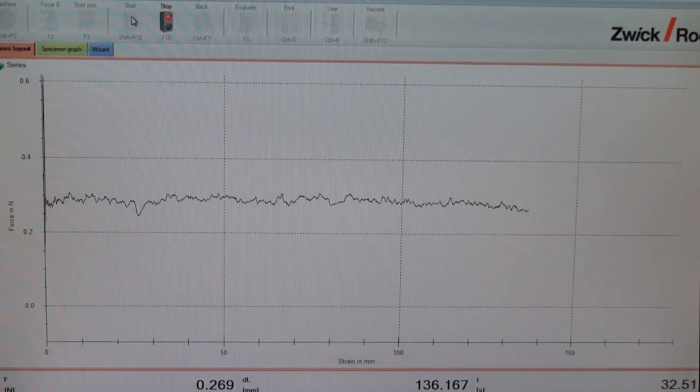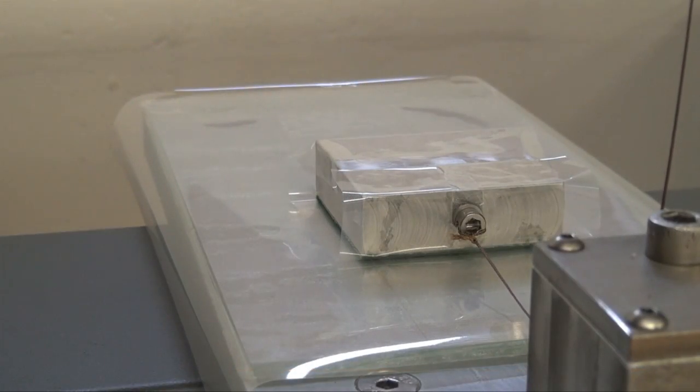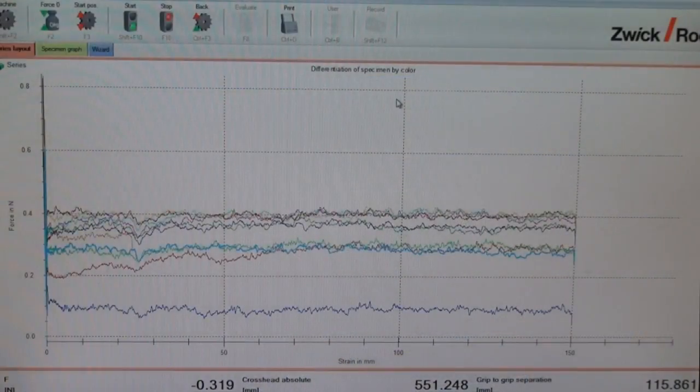Results of the tests are graphically displayed. The equipment makes it possible to graphically overlay results for comparison purposes.